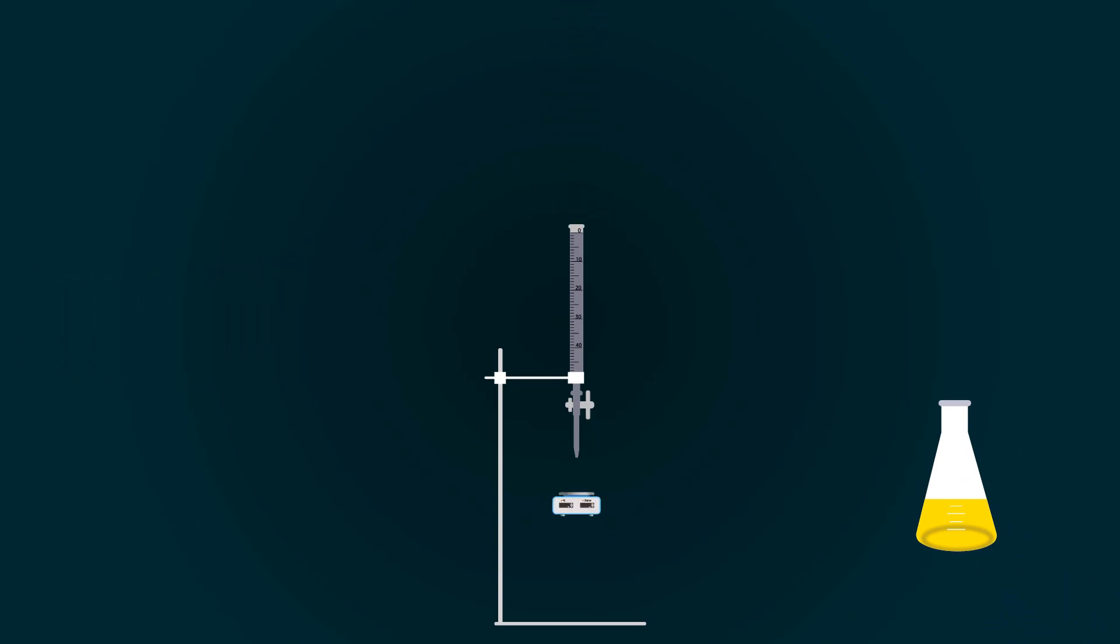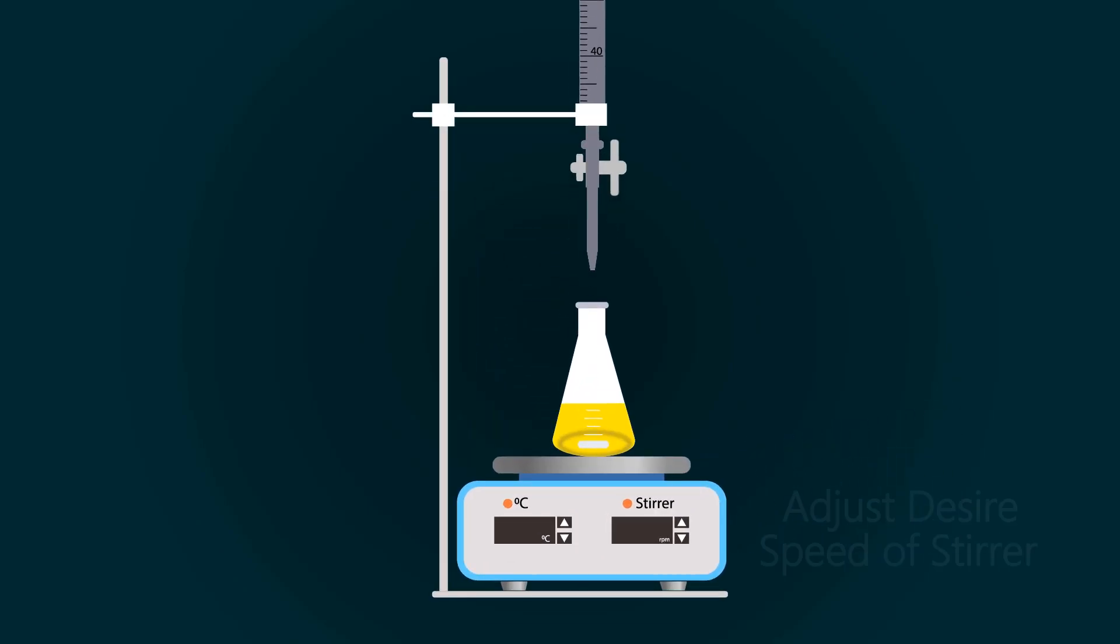Now adjust the magnetic stirrer under the burette. Add a magnetic bar into the conical flask. Put this conical flask onto the magnetic stirrer. Now adjust your RPMs.